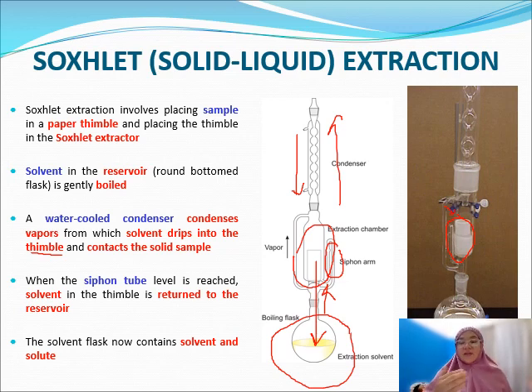So the process can be continued for hours until days. As long as you make sure you put all the components in directly, so that nothing spills out, the process will occur fluently. And it can go on for days, or weeks, as long as everything is in place, because the solvent will not disappear. It will go back to the reservoir, and it will keep vaporizing and condensing.